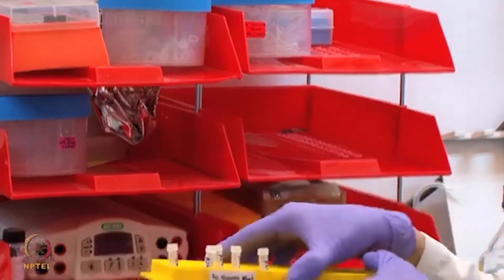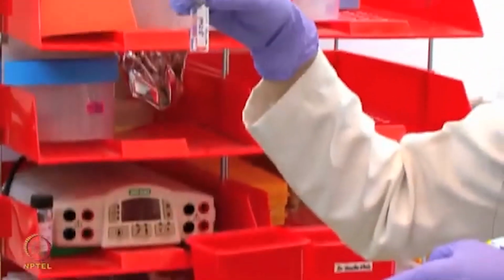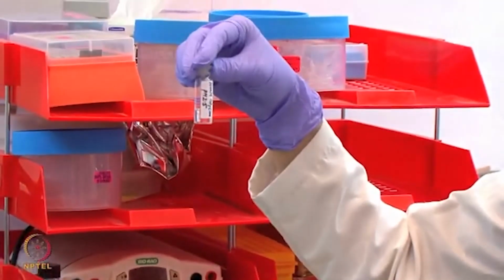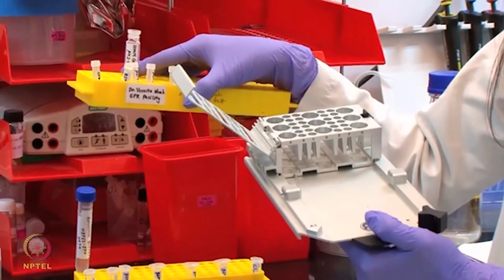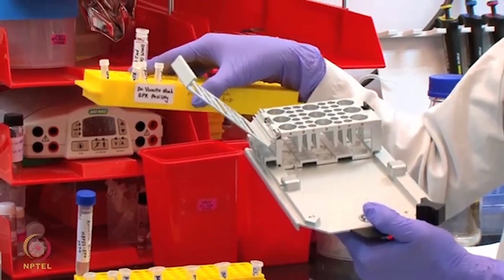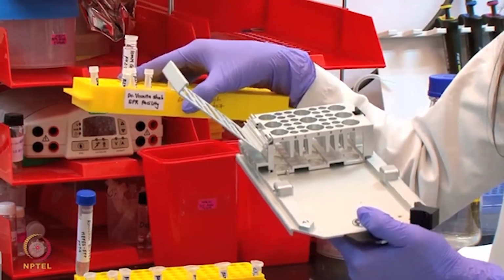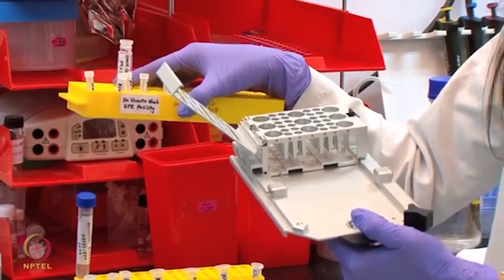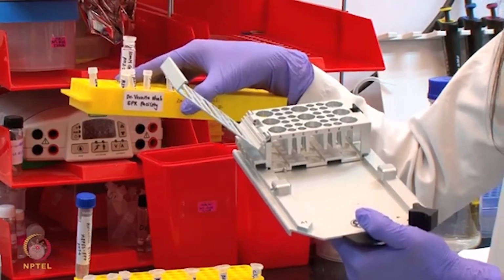The regeneration solution is placed in this glass vial. We will now insert these tubes into the appropriate rack and then into the system to start with the binding analysis of anti-beta-2 microglobulin with beta-2 microglobulin protein.